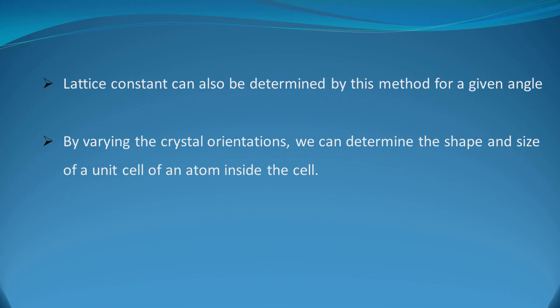Lattice constants can also be determined by using this method. By varying the crystal orientation, by changing the rotation of the sample holder, we can determine the external features such as shape, size and the various unit cell parameters a, b and c.